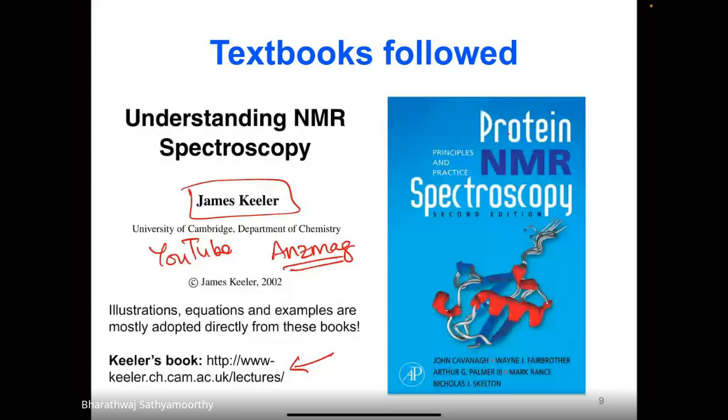gives you. So overall, I always see there is a compromise between sensitivity and resolution that you end up getting. Techniques that are extremely sensitive average information. On the other hand, things that are less sensitive give high resolution. Okay, so that's where NMR scores. I hope that answered your question.